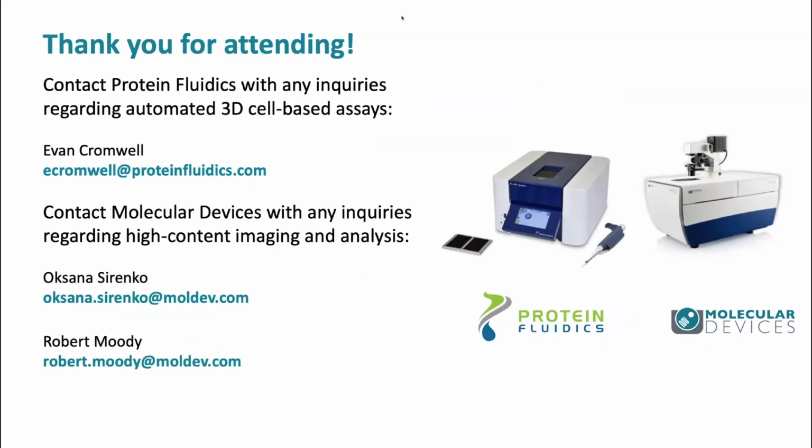For multiple spheroids and organoids, this is very useful, and you can do it using the custom model editor. With this application, you can define spheroids or organoids first and then count different cells within them, characterize those cells as live, dead, or positive or negative for different markers, and estimate area or intensity.